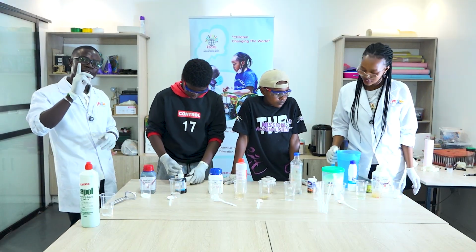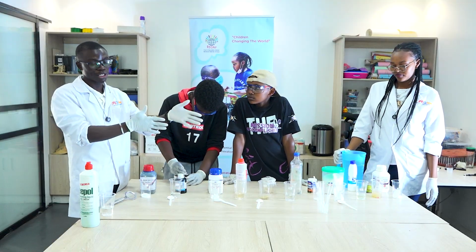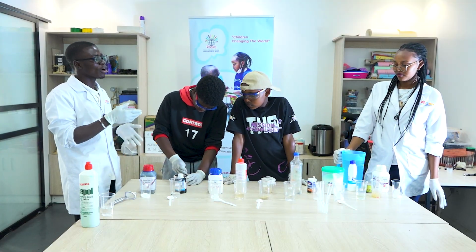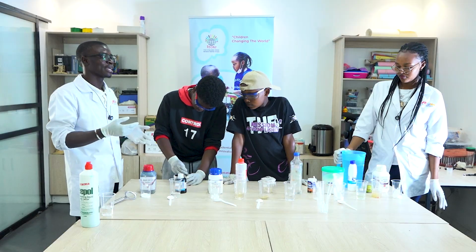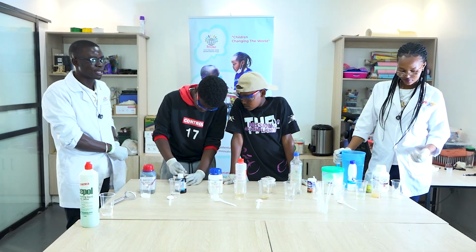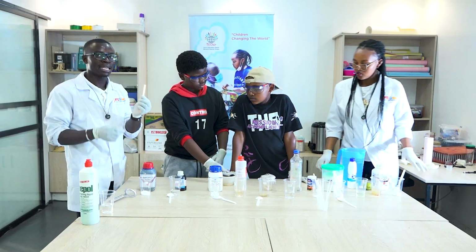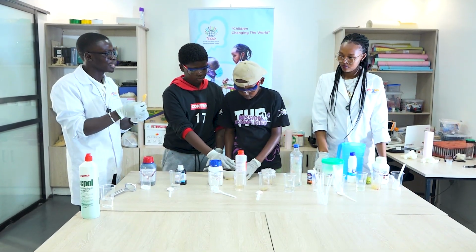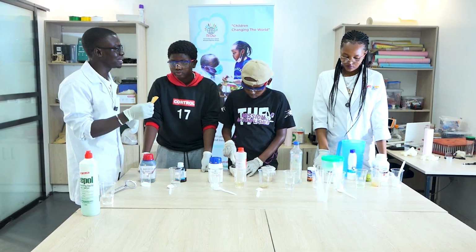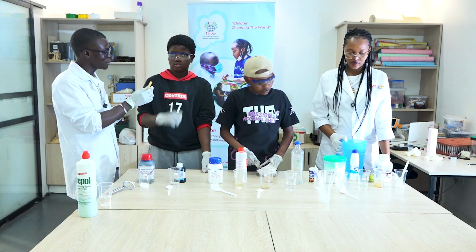Now, the fun part of this is we are going to observe the color changes in all the solutions we're going to have. As we dissolve them, we are going to first use our litmus paper. We have litmus paper with us, this one, and it's going to change color depending on whether the solution is a base or an acid. This is called a litmus paper.